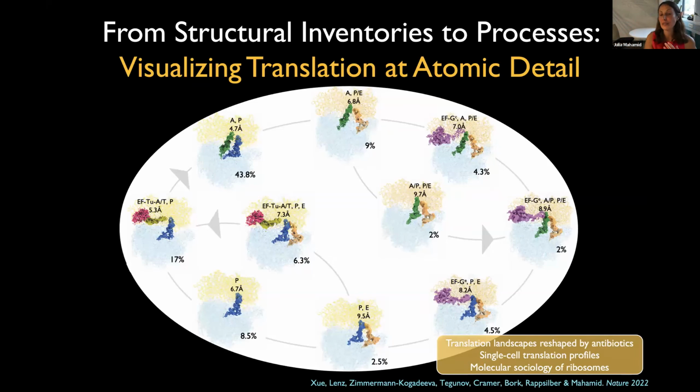And so to summarize, this project with a very minimal cell model really allowed us to establish the methodology, the image processing, the data integration approaches that really allow us to bring cryo-electron tomography to a level where we can really start tackling more complex systems at higher biological complexity and address questions that we are also very much interested in, and I will be telling you about for the next few minutes.